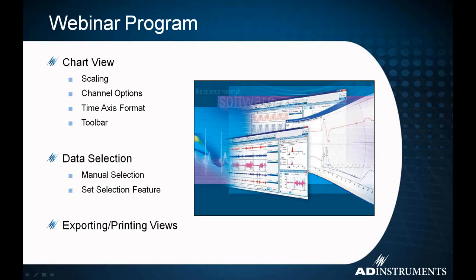The other thing that we'll talk about here is selecting data, the different ways you can select data. And the reason we're going to talk about selecting data is because selecting data leads us naturally into creating images and exporting those images to other pieces of software. Now, this is a very generic overview, but the other things that are going to be mixed in here are the way that LabChart is laid out. We're going to use a feature called layouts to determine how LabChart is seen and how we use it. We're also going to change quite a few features in just the way that LabChart is presenting data to us. So we're going to look at all those together.